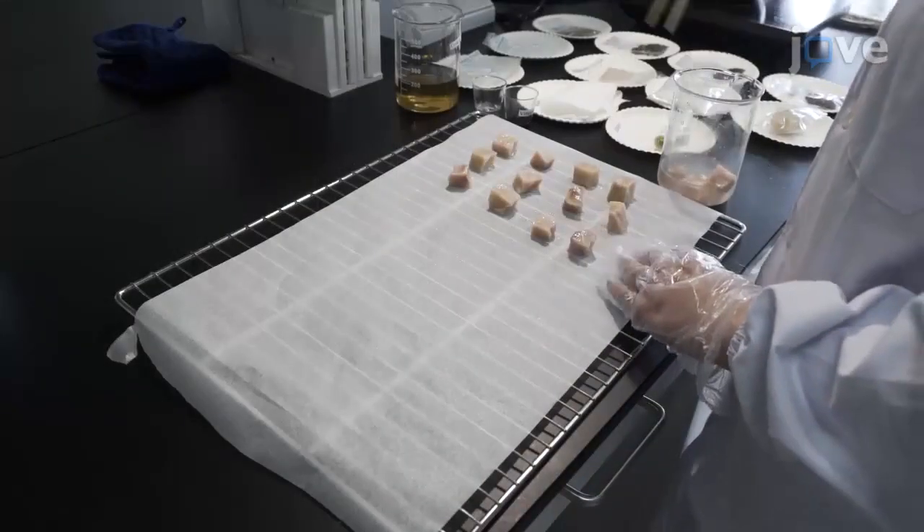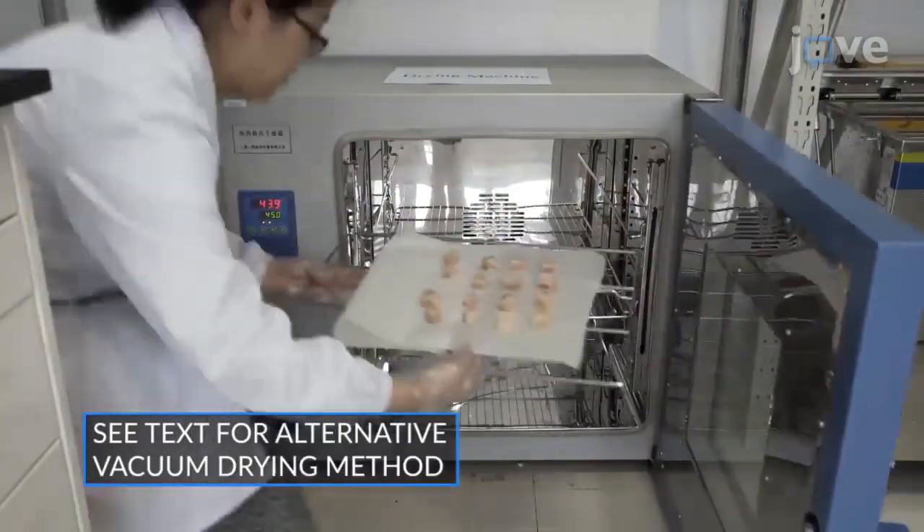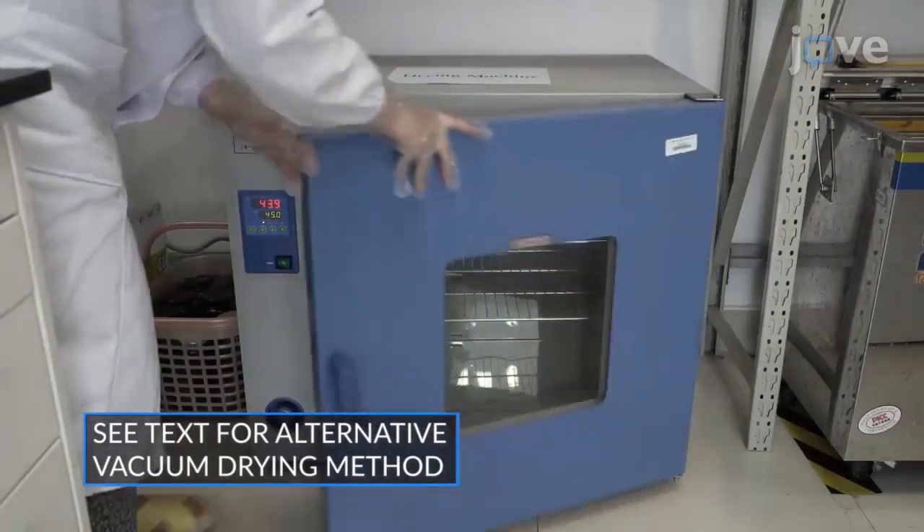Then, put the marinated fish cubes onto a stainless steel gridding plate and dry them with hot air at a temperature between 40 and 60 degrees Celsius for 6 to 10 hours.